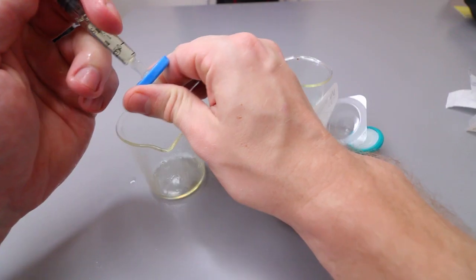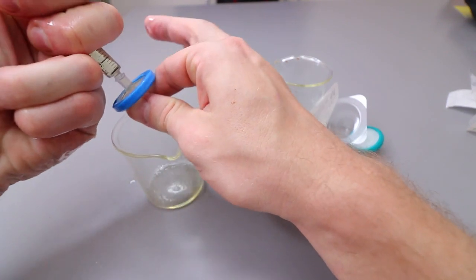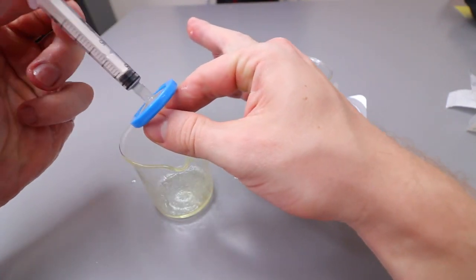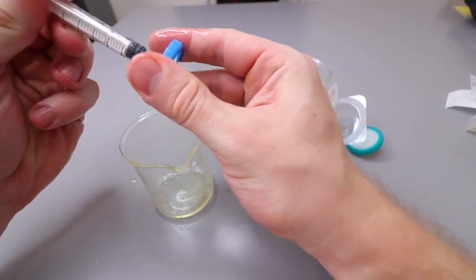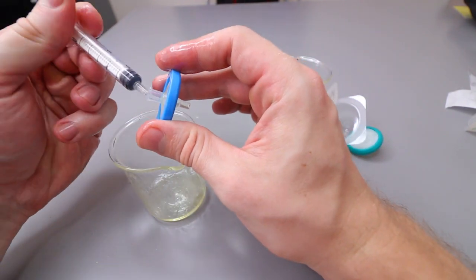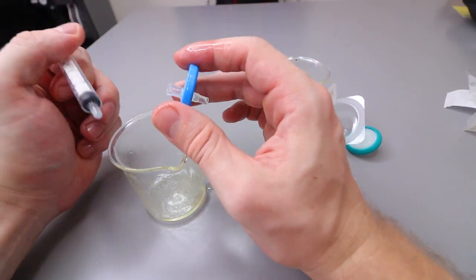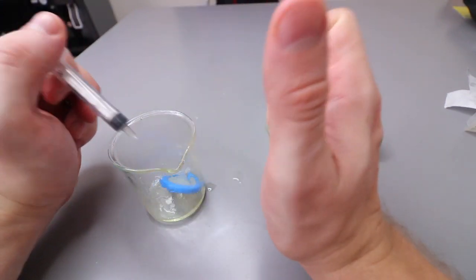But if I actually hold the top I can actually just push through the whole amount of gear and break the filter. So that's kind of the problem with it. The membranes break real easily on the cheaper ones.